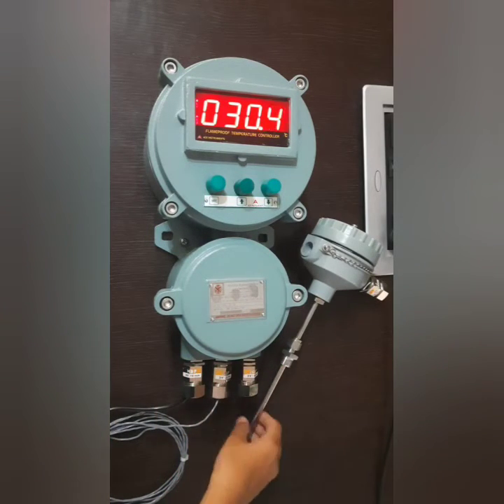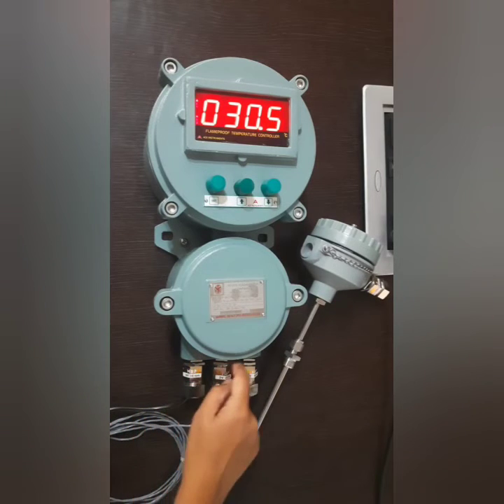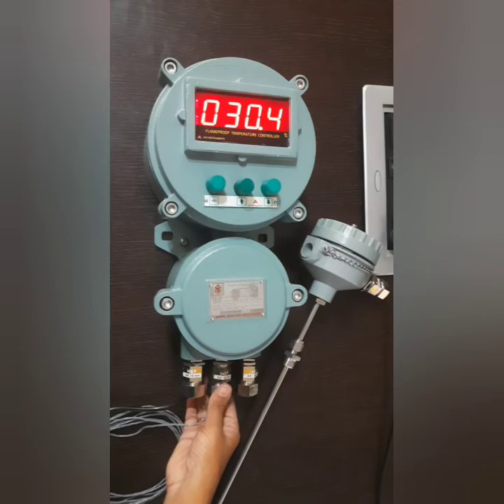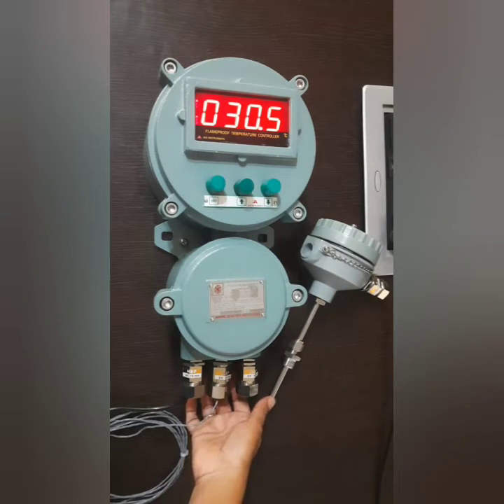This is a three gland entry instrument. The glands I have already connected are also 19mm double compression 3/4-inch glands. Even five gland entry is also available in this product.